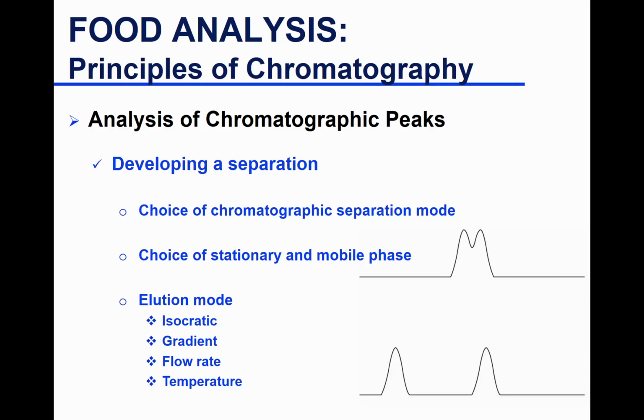I might have to consider the elution mode. So you might have started with isocratic. It took 2 hours to finish because you have, let's say, a very polar and a very non-polar compound in reversed phase. One came very quickly and the other one took 2 hours to come out. Can't afford that. So I start working with my gradient, increasing the strength of the mobile phase.